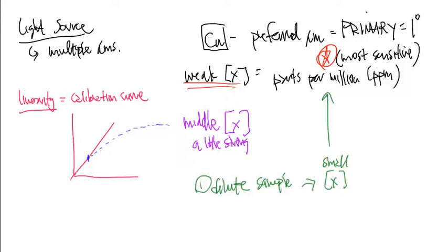So that requires a little bit of extra math, right? After I get the concentration, I'm going to have to do a little bit of extra math called a back dilution, because I've taken the sample and I diluted it in order to run it. So then I have to go back and refigure what that concentration is because I diluted it in order to run it.